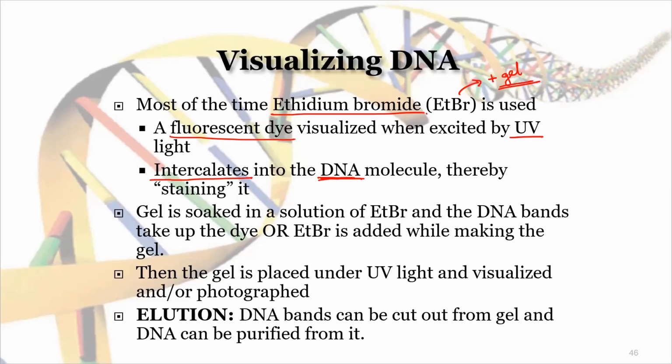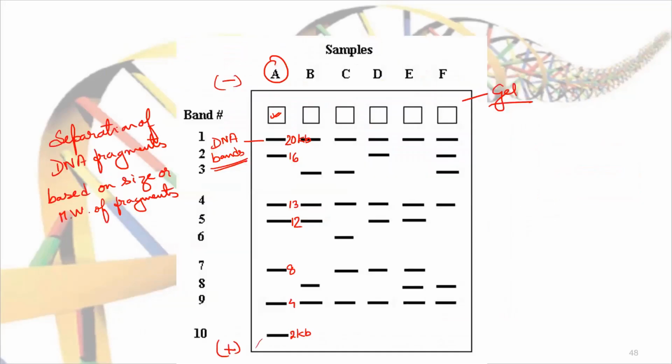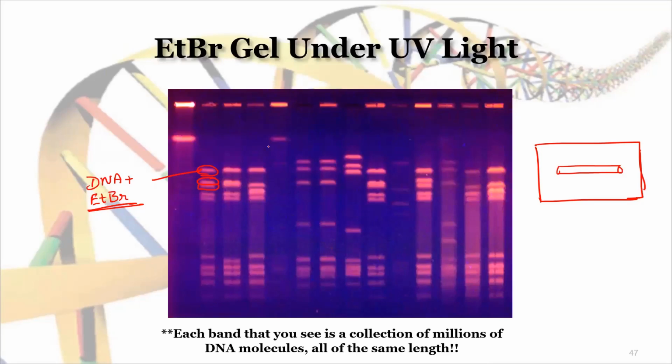Then another question that comes in the exam is, let us say after doing this, let us take any one example. Suppose you have taken your sample here, right? Sample means what was the sample? You have taken the DNA earlier and cut it down, and after cutting the DNA, multiple fragments were formed. Now your idea is to identify a particular fragment which is of your interest.